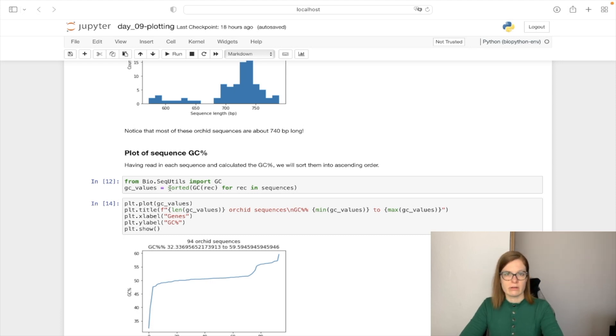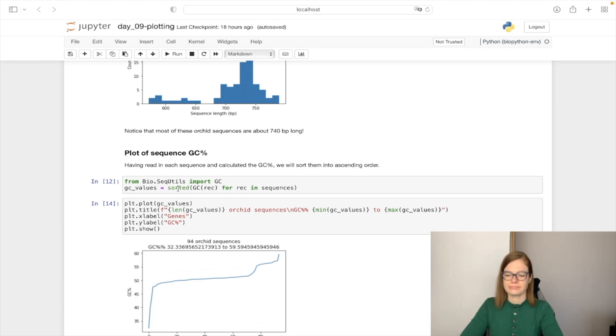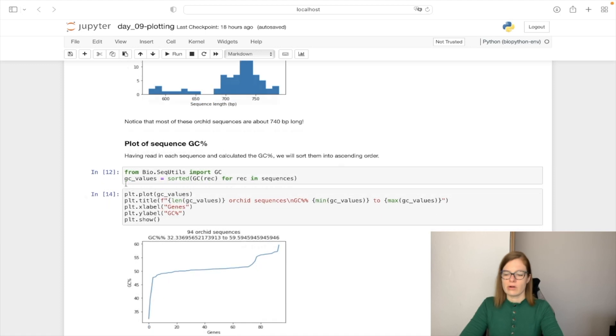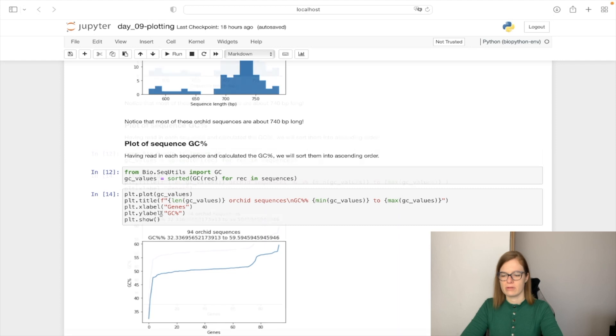And then we are going to sort them in ascending order using the sorted functionality. We are going to plot using the calculated GC values. Again, we are going to set the title, xlabel, and y label.